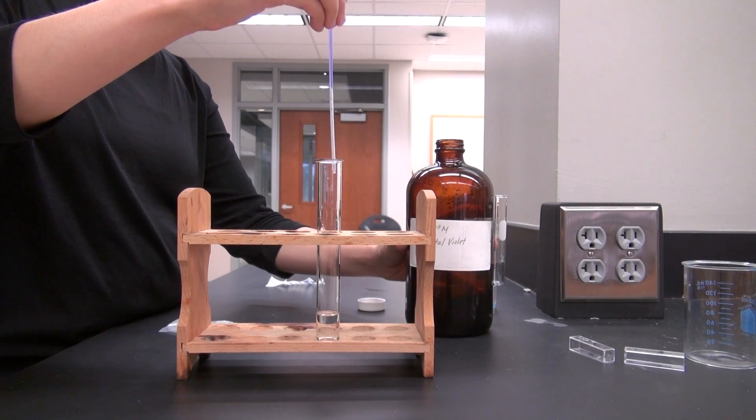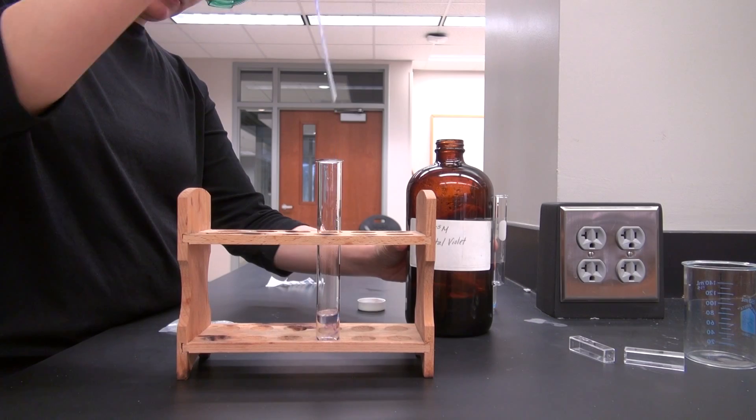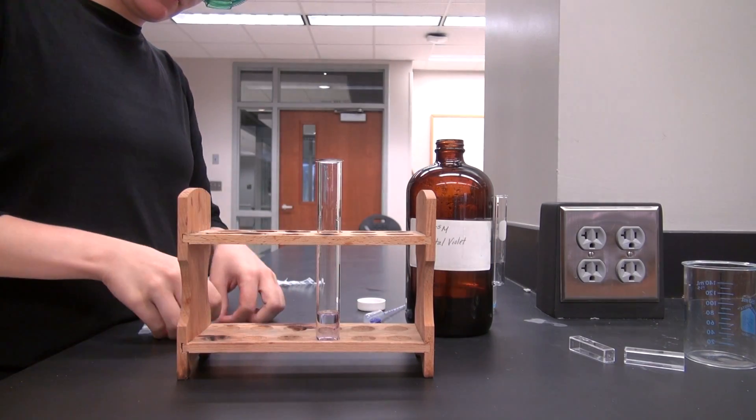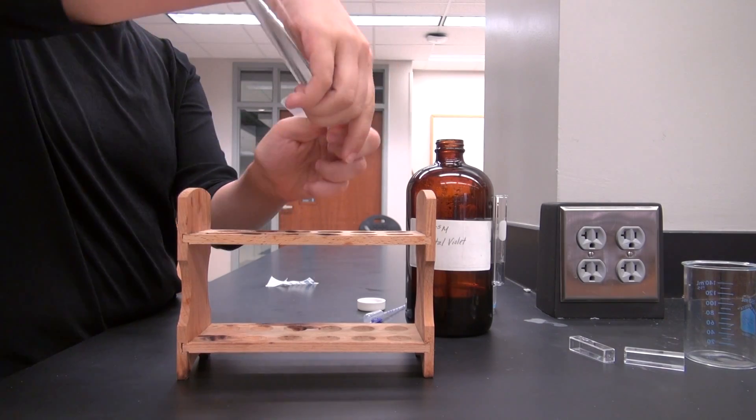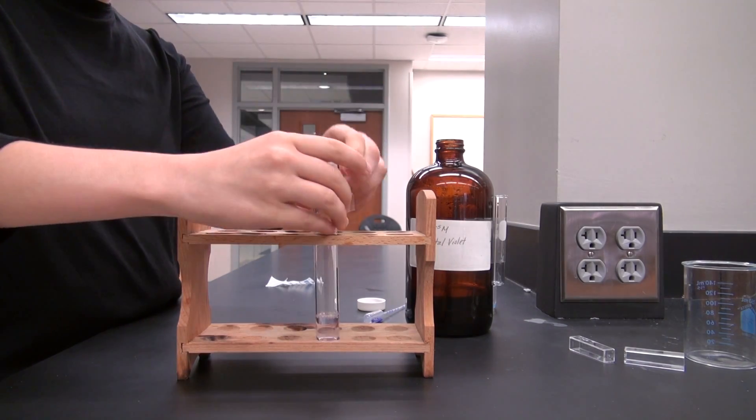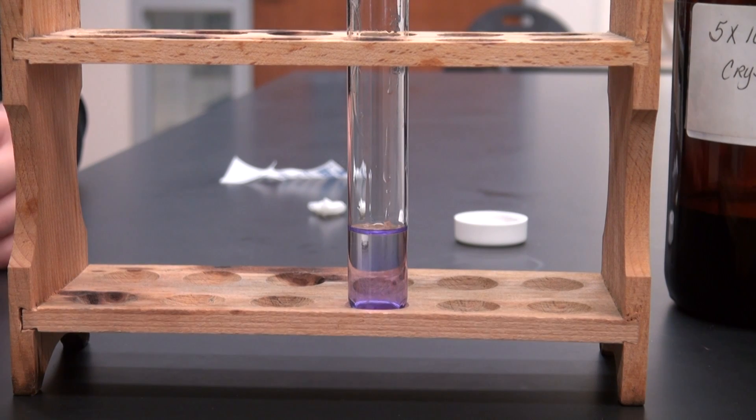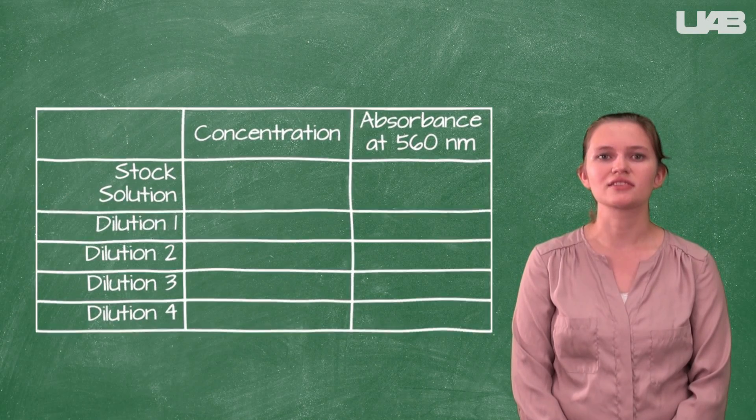So you will know what was happening in the spectrophotometer, you will add one drop of the stock crystal violet solution to a test tube containing 7 mL of 0.2 molar sodium hydroxide solution so that you can observe the reaction before you have to record any quantitative data. Record your observations in your notebook.